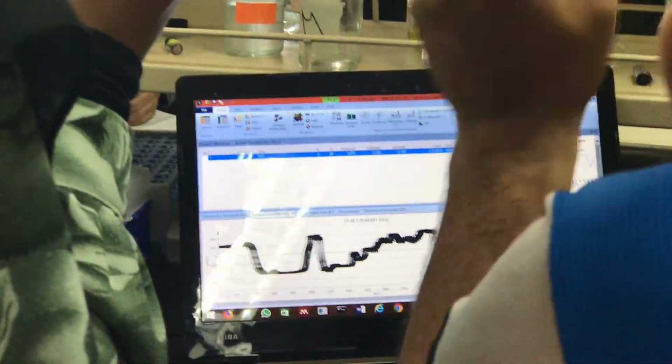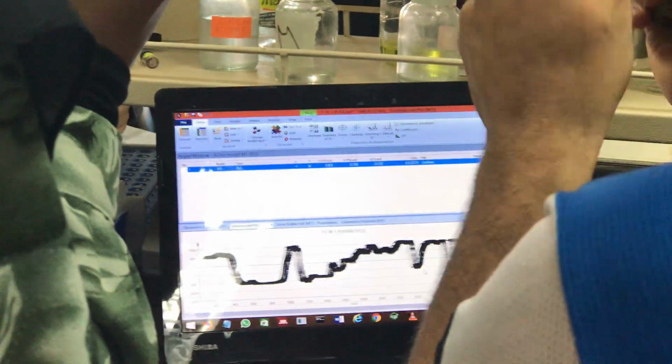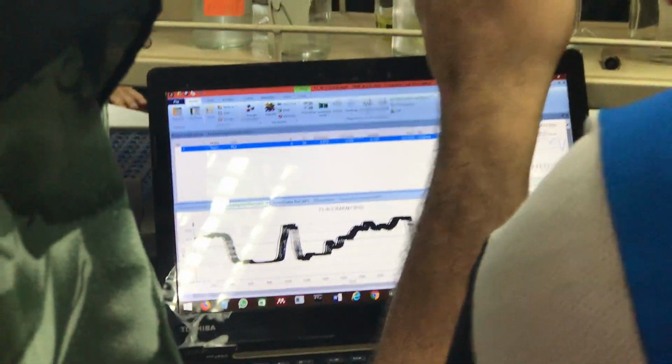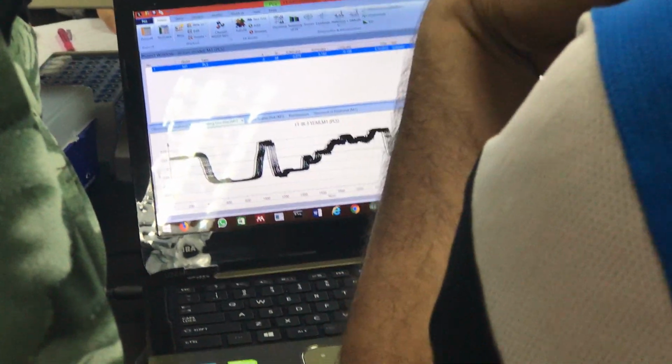Is it a bit difficult for you because it's the first time? In this case, don't worry about it. I think it's so difficult for you. Even for me, it takes 1 year to understand this software.